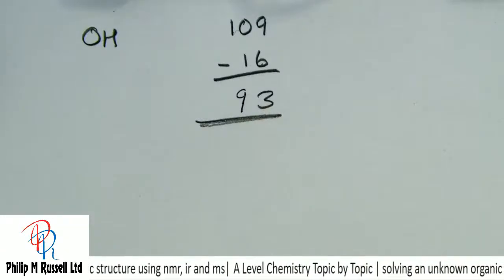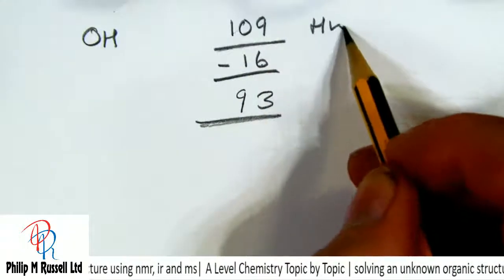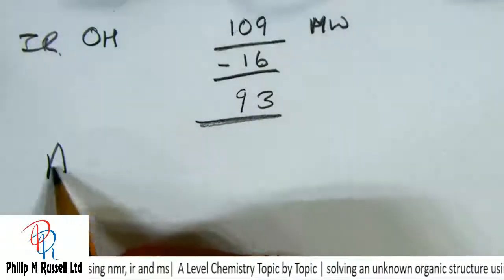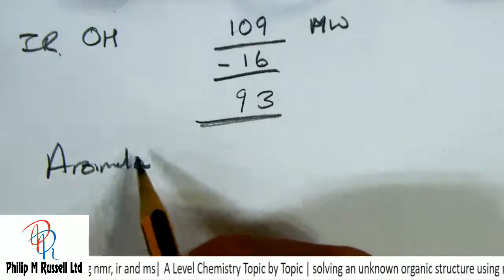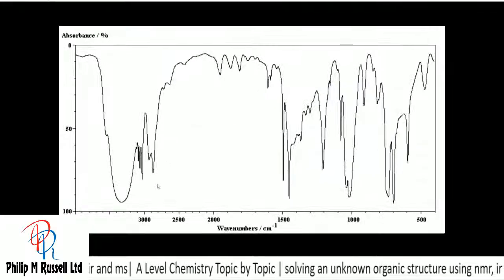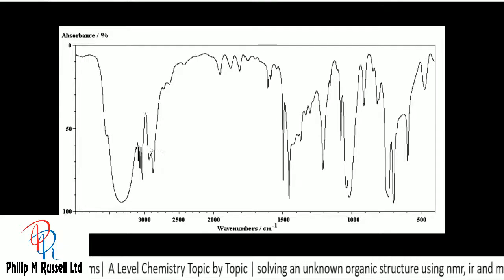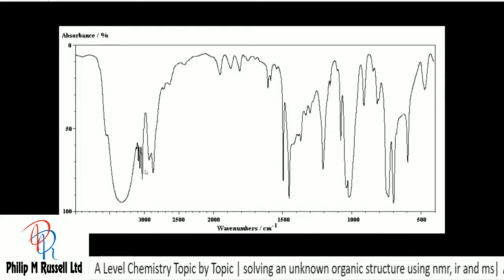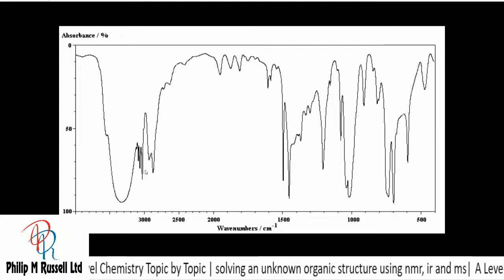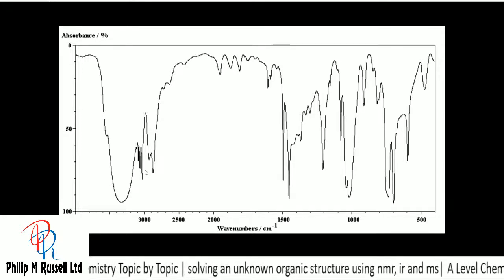Now, we did see in the IR there were aromatic hydrocarbons happening. So roughly the benzene. If I go back to the IR over here, that was our benzene. You've got some aromatic stuff and some carbon chains. So if you just look at benzene, that's 6 carbons and 6 hydrogens. So 6 twelves are 72.